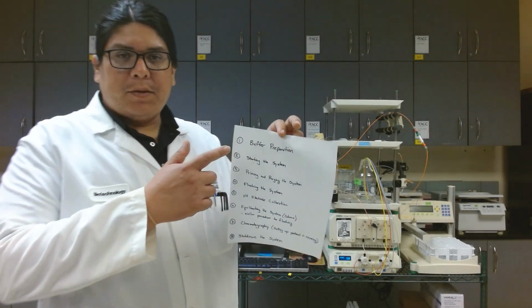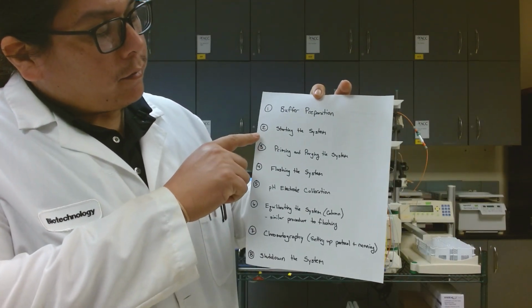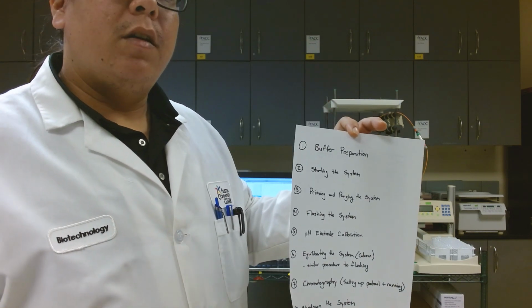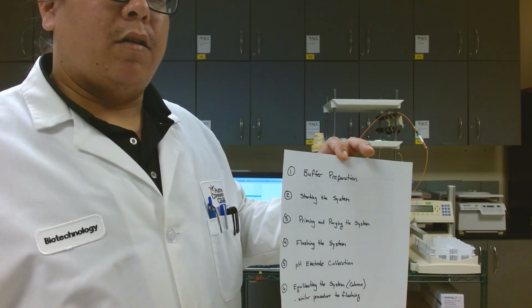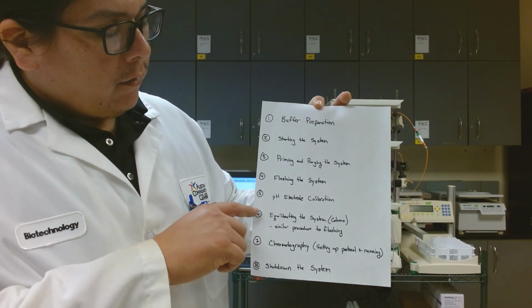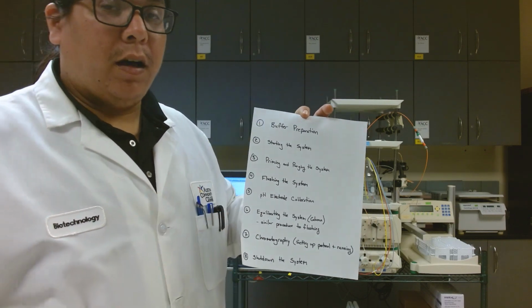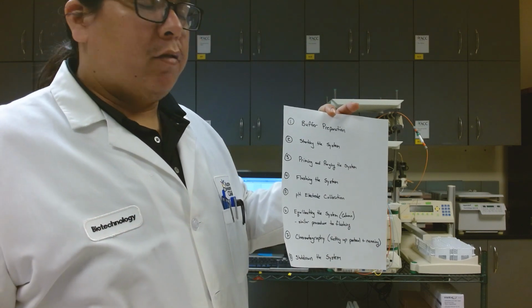We've gone through these steps here. We've prepared our buffer. We've started the system. We've primed and purged the system, and then flushed the system. Remember, it's in 20% ethanol. We flush that out with water, and then we'll flush the water out with our buffer that we're going to be using during the purification. We've calibrated our pH electrode, and we equilibrated the system, or the column specifically. When you think about equilibrating, it's the column that you're equilibrating.